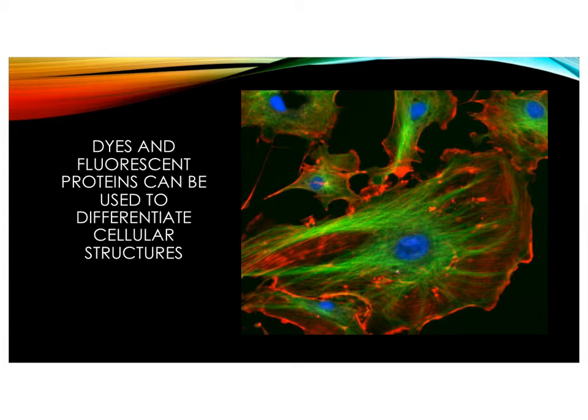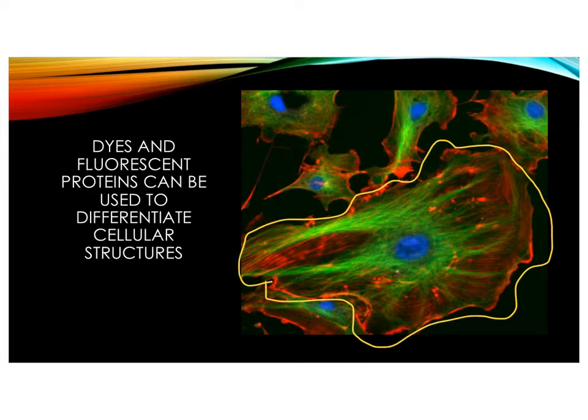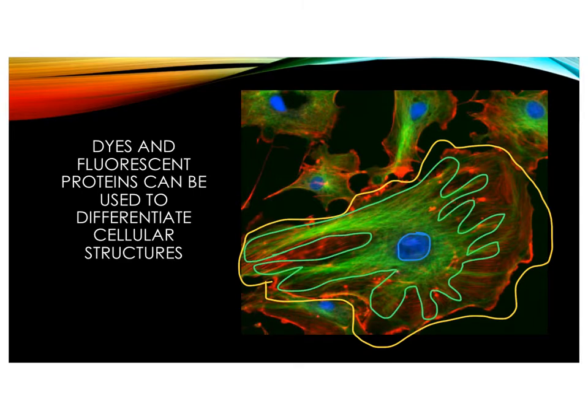Different fluorescent dyes and fluorescent proteins can be utilized to probe different structures to help further study physical attributes of biological systems. You can see in this figure a eukaryotic cell fluorescing different colors to differentiate between the nucleus, tubulin, and actin. This is one small example. Fluorescent molecules can be applied as a tool in the research world.